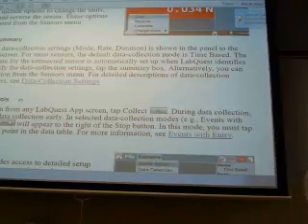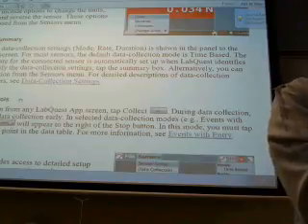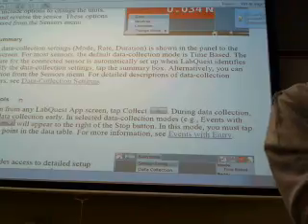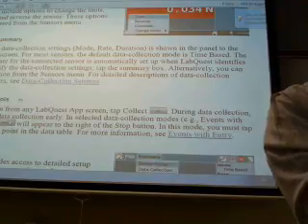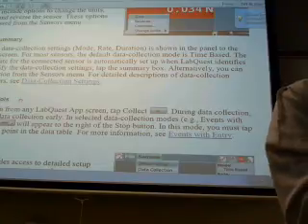Let's try to find the summary box. Where's this? You're right, where it says mode, right? Okay, got it. Mode, rate, duration is the summary box. It's a summary of the data collection experiment.